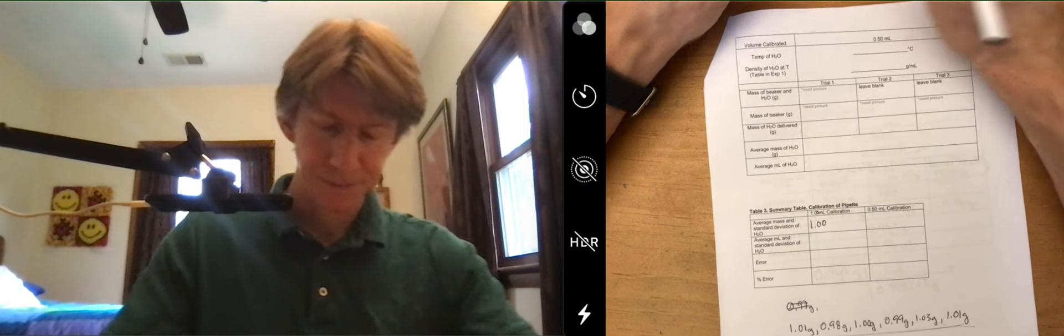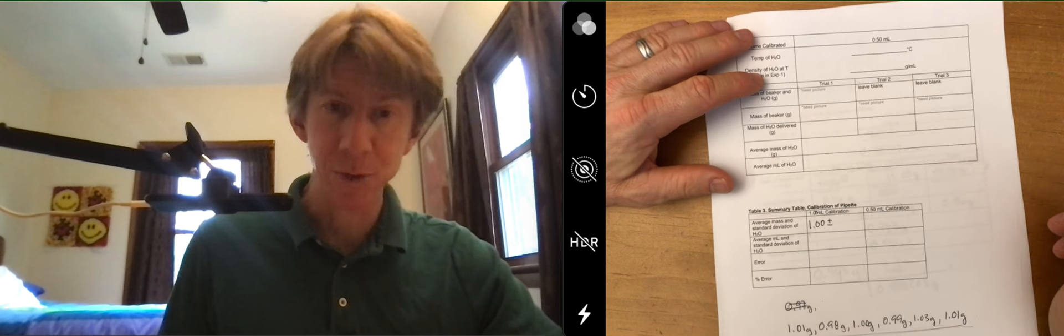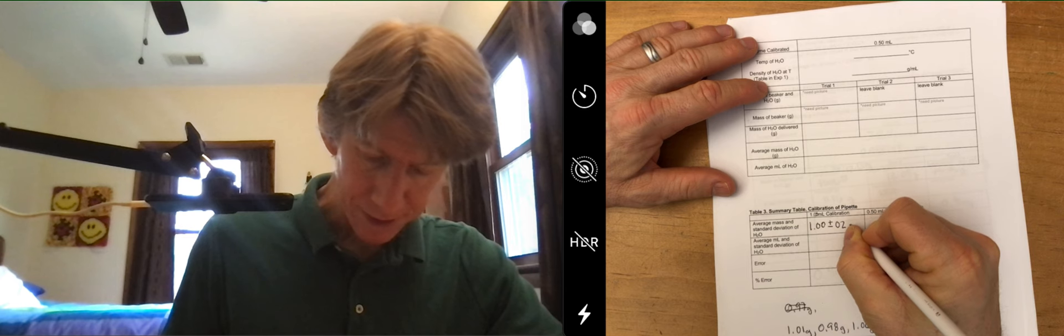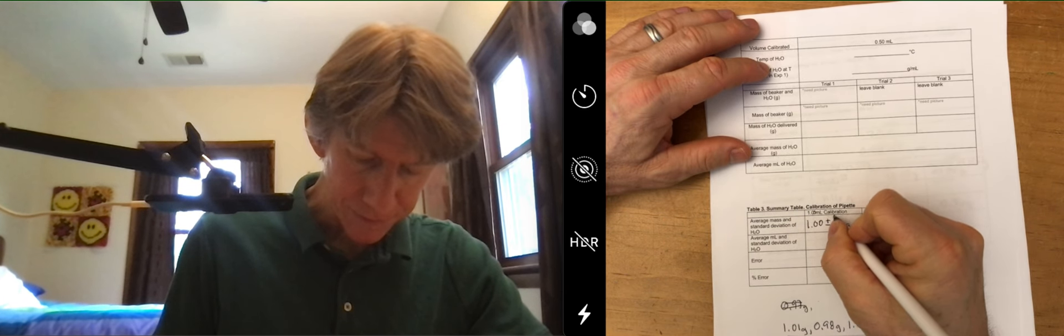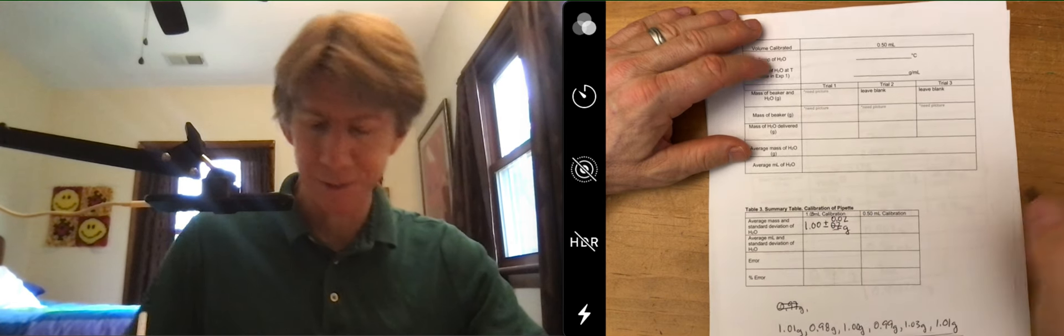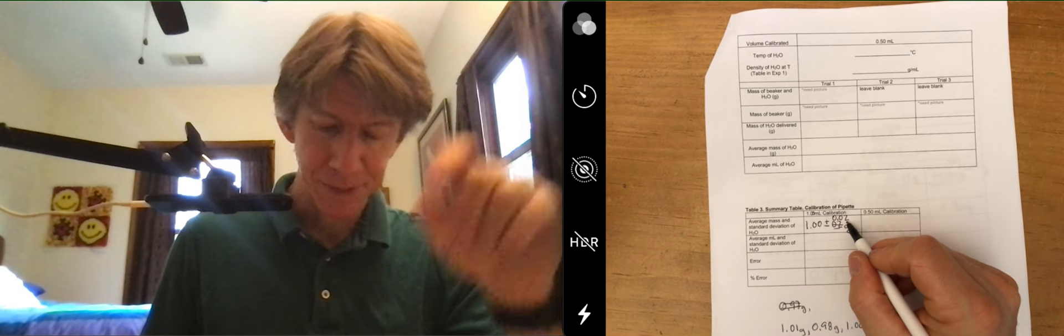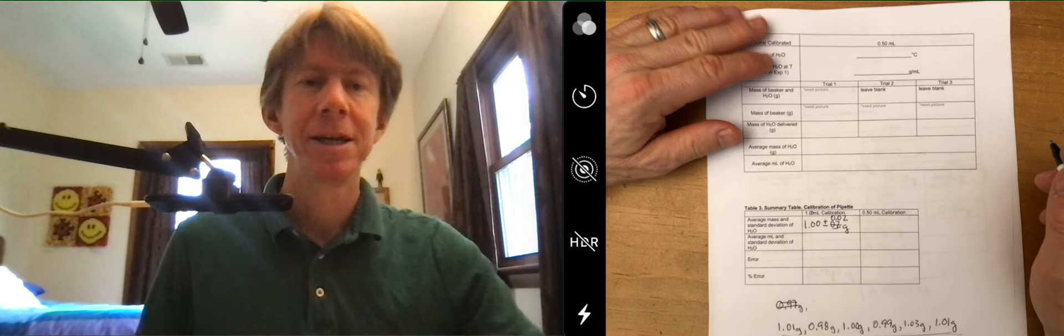Those are still close enough, doesn't have to be exactly one, mine worked out that way. And then I got 0.02 grams as my standard deviation. Remember standard deviations only have one sig fig which this one does, and the decimal point of the standard deviation matches the last decimal point of my number.